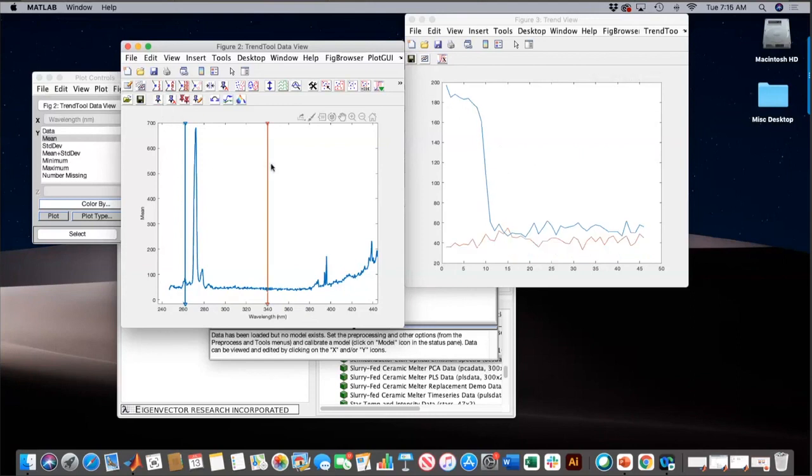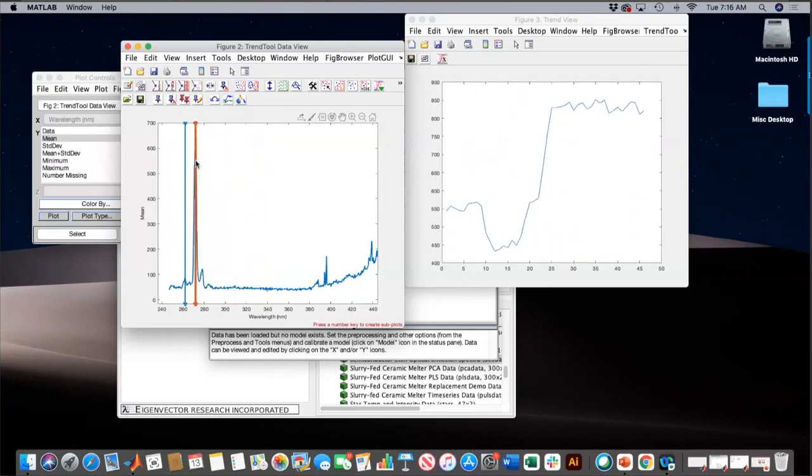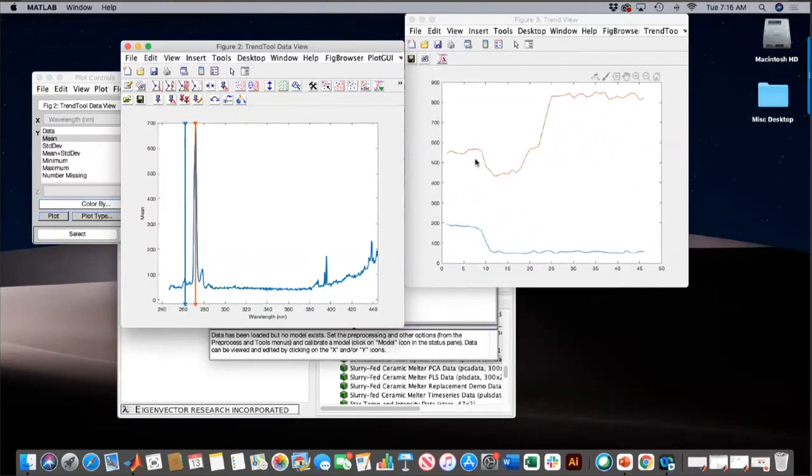You can add another marker. And what about the big peak here? And so here, this is in red. It's this curve right here. This is from the BCl3 etch gas. And what happens with the etch gas is that it is being consumed when you're etching off aluminum or titanium. And when it's no longer being consumed, the concentration increases because it's now at the concentration of the inlet gas. So here you see it's being consumed by aluminum, it's being consumed by the titanium etch a little faster, and once that's all done, it goes back to background level here.